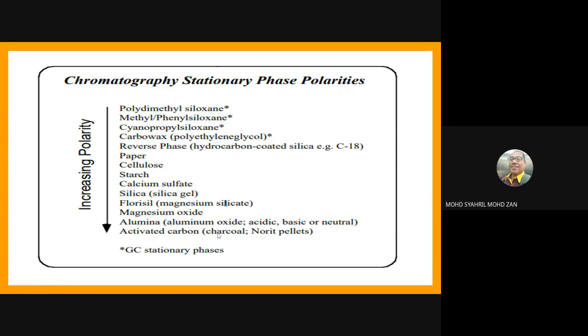So base yang kita gunakan kebanyakannya kita pakai 4 star ni. Barulah kita mix with other substance, such as paper, glucose, cellulose. Dalam mostly lab kita akan gunakan 4 bahan ni dan juga campuran dengan silika ataupun alumina.